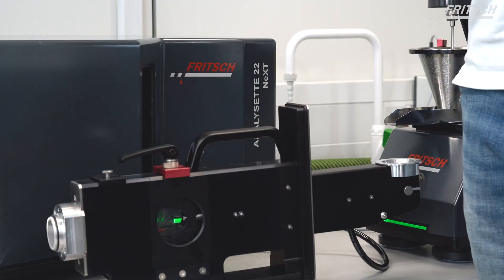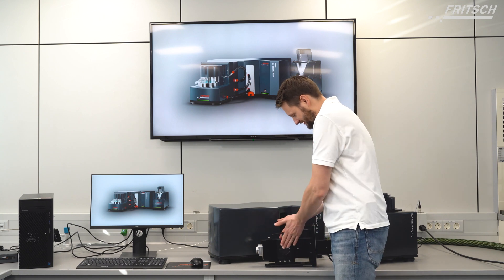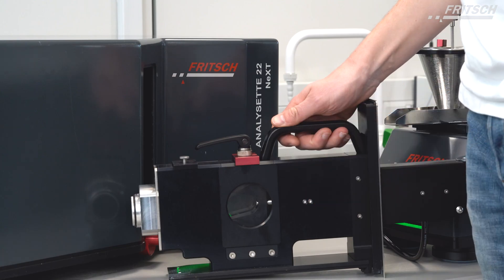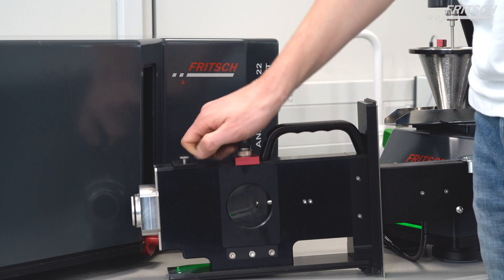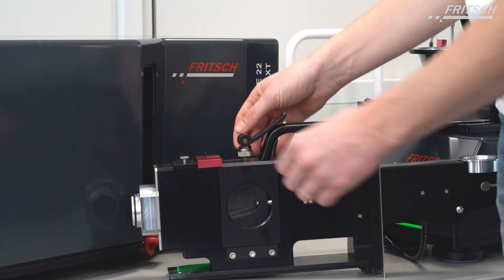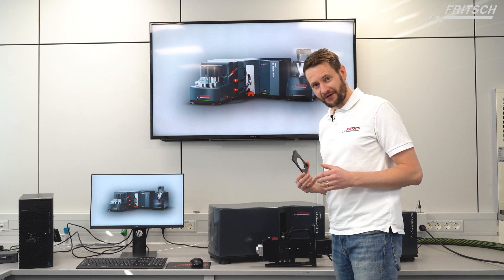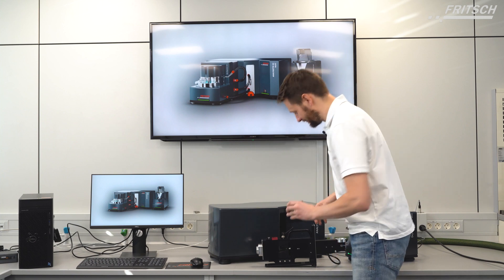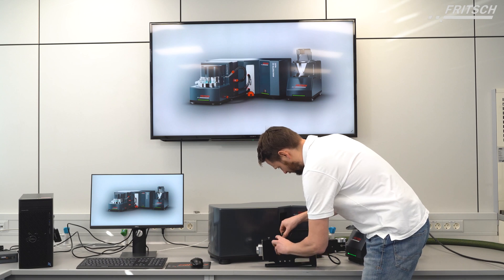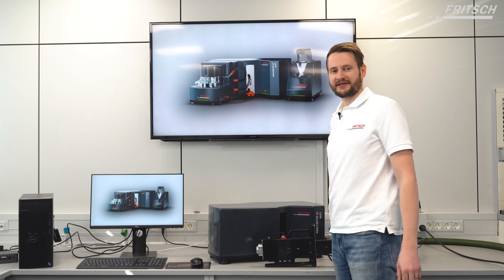With the measuring cell, we kept it simple. First of all, we broadened the distance between the glasses in order to reduce contamination. In case cleaning should be necessary anyhow, you just open the quick release, push forward the red holder, and take out the glass.